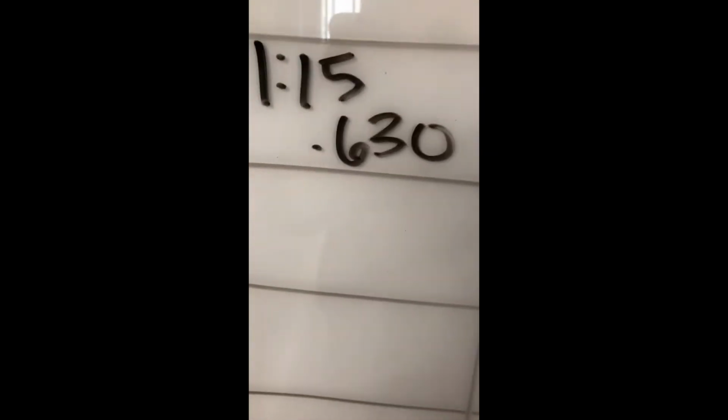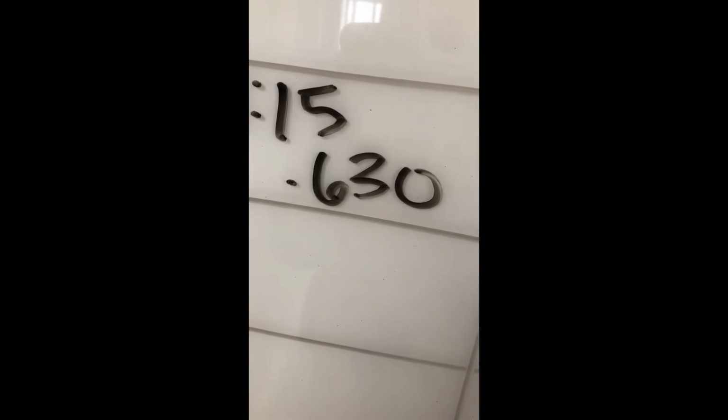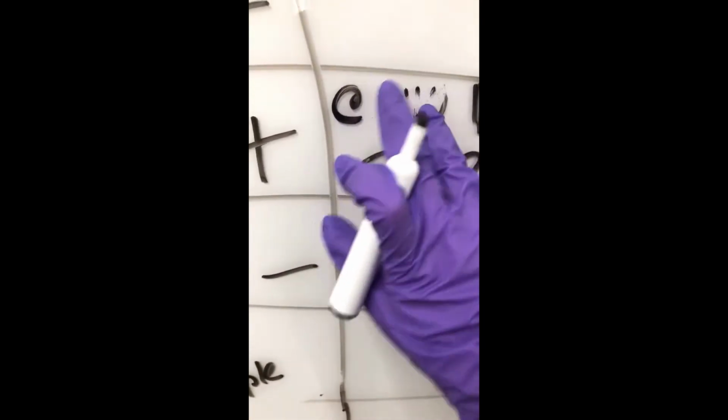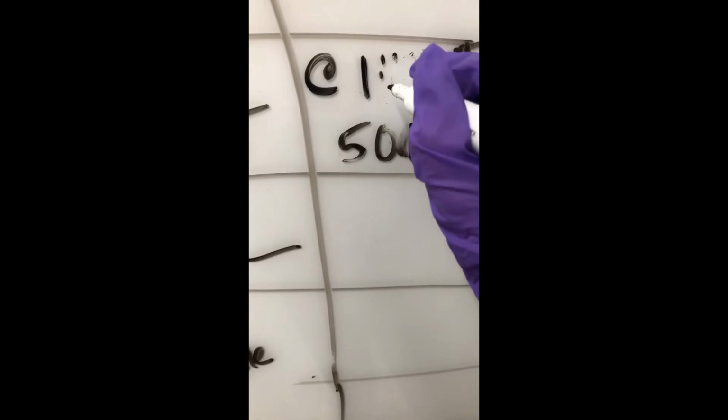So we're going to stop the collection of that guy there because, oh, whoops, these times are wrong. It was 1, yeah, actually no, they're not. So now at 1:20, it was, let me just double check that, 0.813.